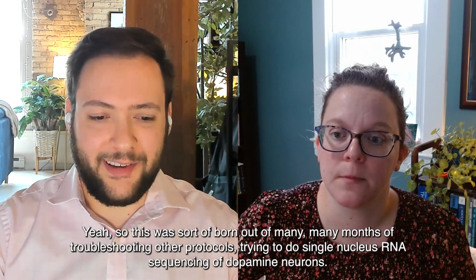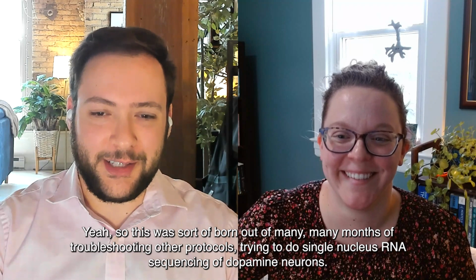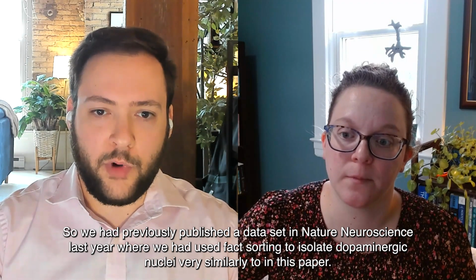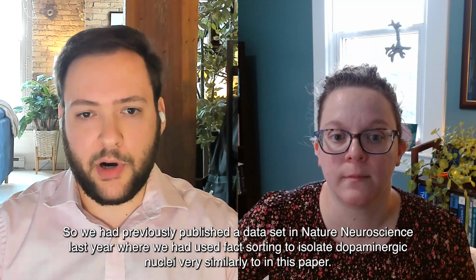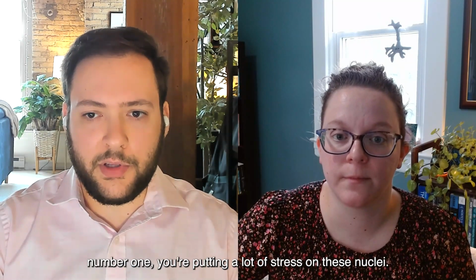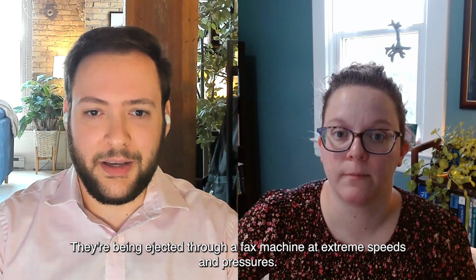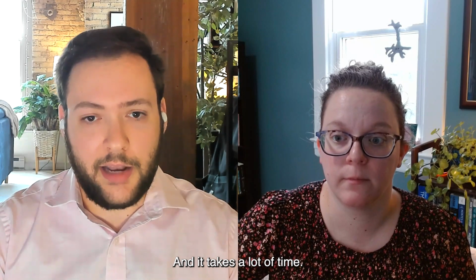Yeah, so this was born out of many, many months of troubleshooting other protocols trying to do single nucleus RNA sequencing of dopamine neurons. So we had previously published a data set in Nature Neuroscience last year where we had used FACS sorting to isolate dopaminergic nuclei very similarly to in this paper. The big issue with those types of methods is, number one, you're putting a lot of stress on these nuclei. They're being ejected through a FACS machine at extreme speeds and pressures. You end up rupturing a lot of the nuclei in the process. And it takes a lot of time.